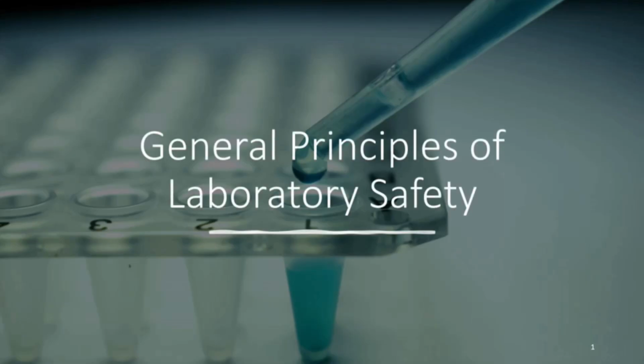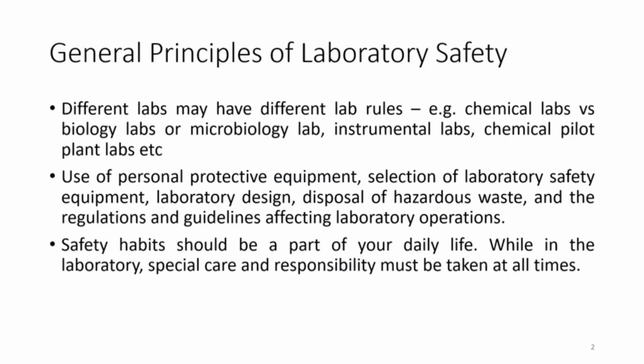In this section, we'll be looking at some of the general lab safety guidelines you should be following when you are working in a laboratory. Depending on the type of lab you are working in, the specific rules may be different. For example, the use of personal protective equipment, selection of laboratory safety equipment, laboratory design, disposal of hazardous waste, and also the regulations and guidelines.